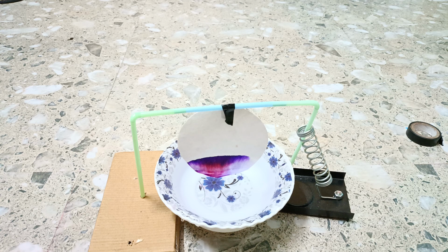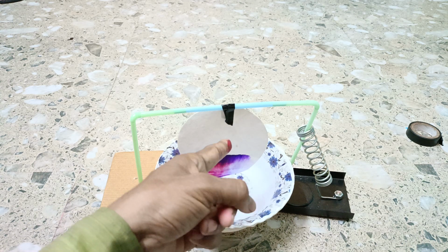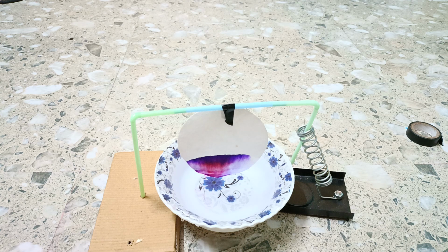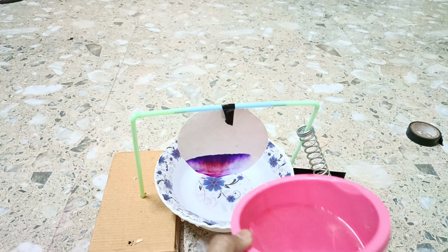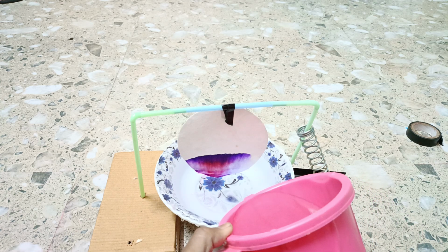One blue color will be separated from the red color. And you see how the water is coming up the paper, and you can see that the red color and blue color will separate out from one another. And this is what we call paper chromatography. You can add more water such that it may take less time. Let us add more water and let's see what happens.